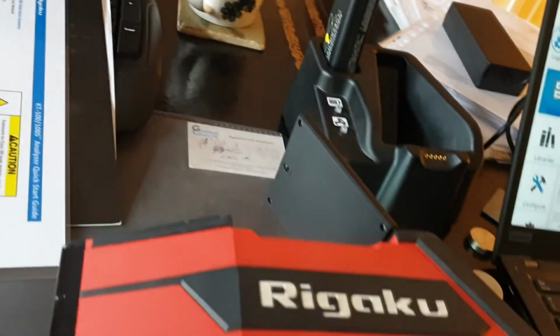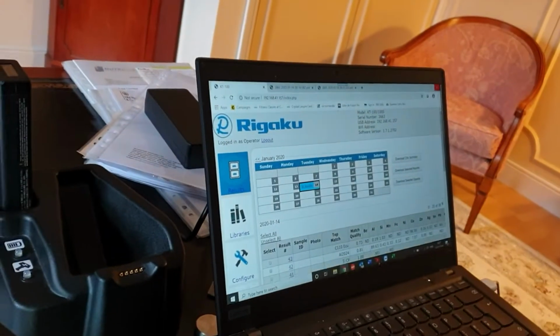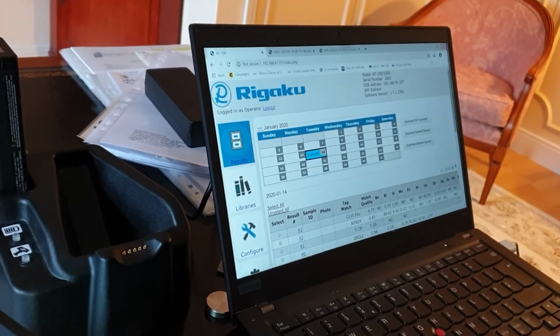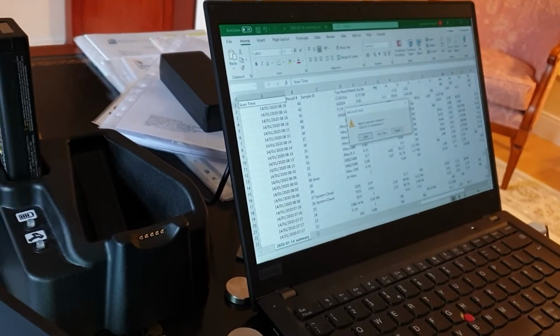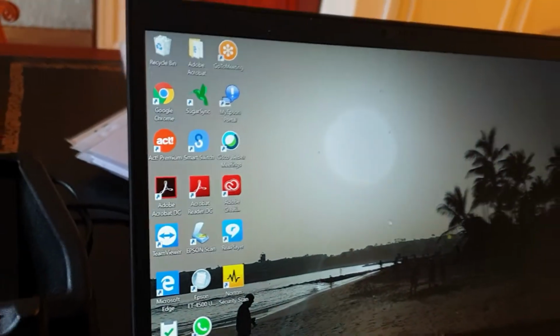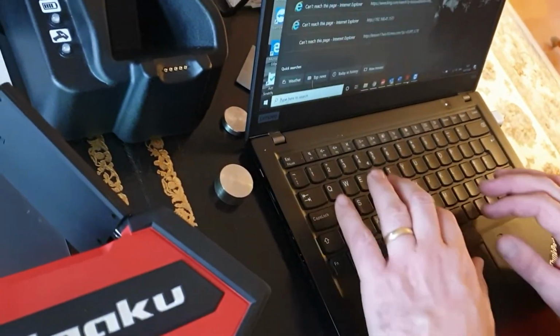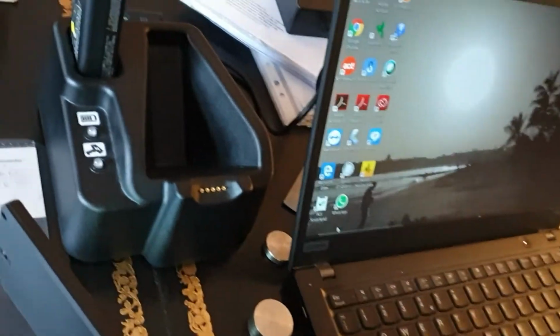Now, there is an extra function, I will show you this, but I think it's probably not beneficial to train you. I can do it if you want. I'm not going to save this. This is special software for the library. Have I got it on this laptop? I'll just check. Unfortunately, I had to change laptop recently, so no, I don't have it.